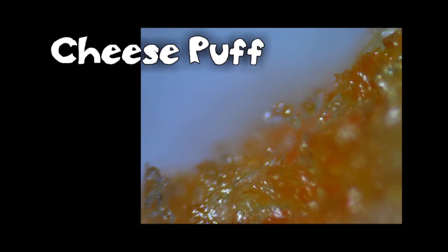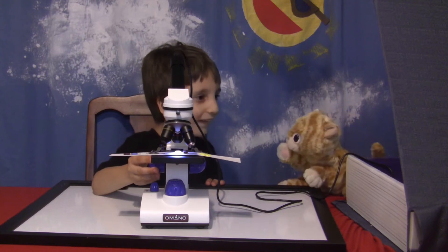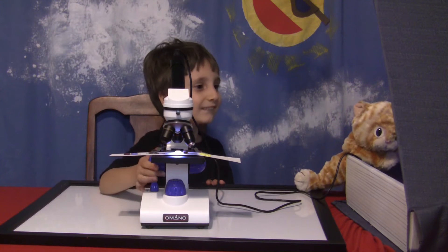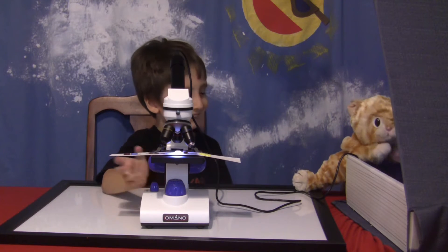Turn it either way just a little bit and see if you can see it in the magic book. There's something! Keep going! Keep going! A little bit, not too fast. Stop right there. That is cool. Let's save a picture. That's what it looks like. It looks like gold. No wonder those are so yummy. I like it.